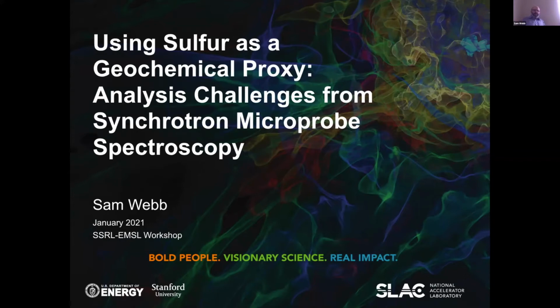The introduction, Sharon. So my talk today is going to talk about how we're using some microprobe spectroscopy techniques to look at sulfur, and in particular some of the analytical challenges for interpreting that spectroscopy. And that's hopefully able to inspire some future thoughts of how DFT type calculations could be used to further explain the science and topics that we're looking at.